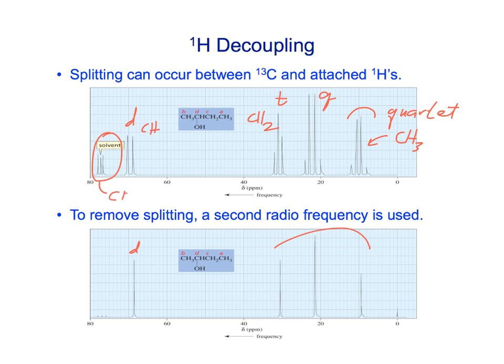This is actually CDCl3. This is the NMR solvent that we use. We didn't really talk about that in proton NMR, especially: we use solvents that have all of the hydrogens traded out for deuterium. Otherwise, the solvent is so much more concentrated than our sample. If the solvent was protonated, the peaks for the solvent would be so huge, they would essentially drown out the rest of the spectrum. Okay?